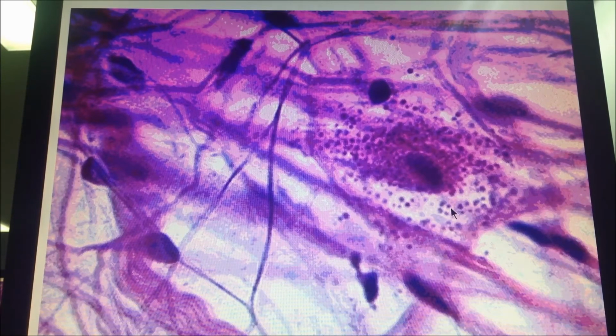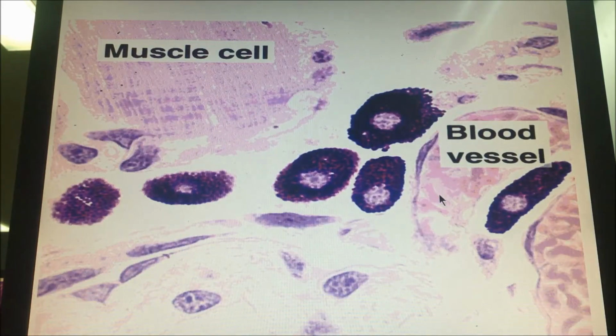But it also has a very unique characteristic, which is metachromasia. Metachromasia or metachromatic means it's able to change the color of the stain, to change it from blue to red. In this area you can see the change happening, but the rest of the granules here, I don't know why there is a change. But we know that this is a mast cell. And the granules of any mast cell might be metachromatic. They change the color of the stain, for example toluidine blue.